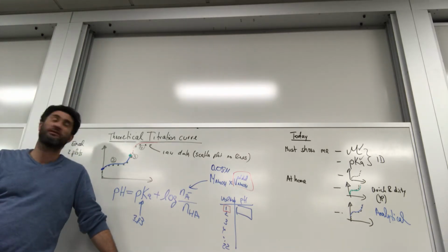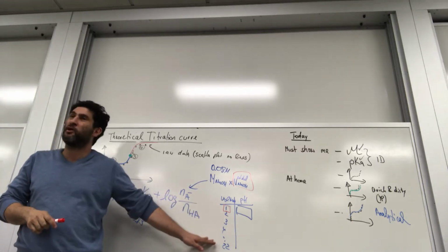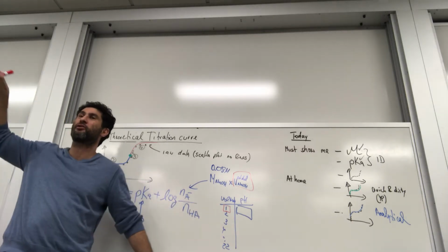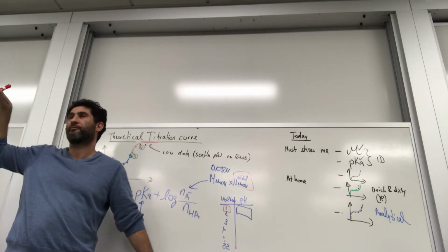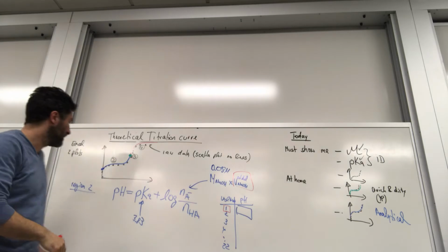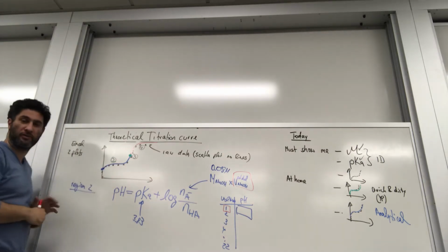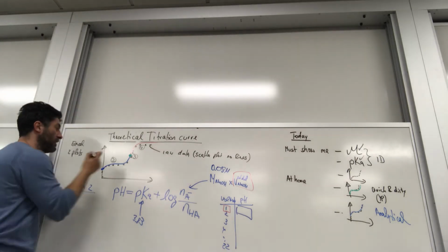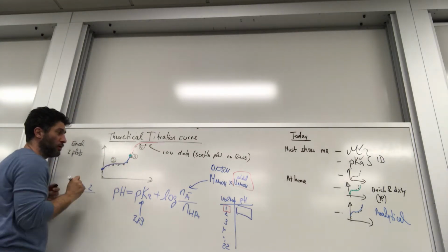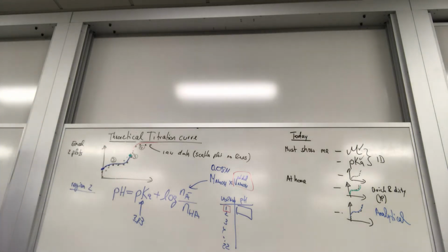So this just means we're calculating for a hypothetical volume added how the curve should look. And you will notice here, where pH is equal to pKa, that curve looks really good. Here, the points will be very close to the curve. But here, the points will deviate a lot when you go away from the pKa, from the volume where you have the pKa, half equivalent.